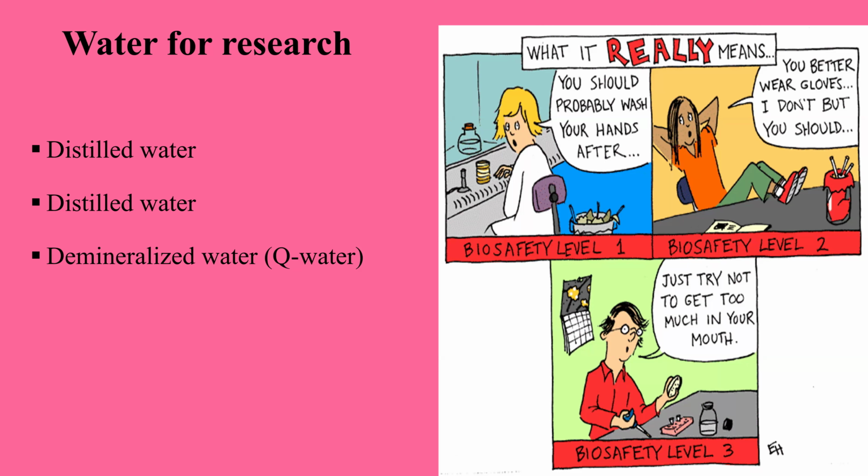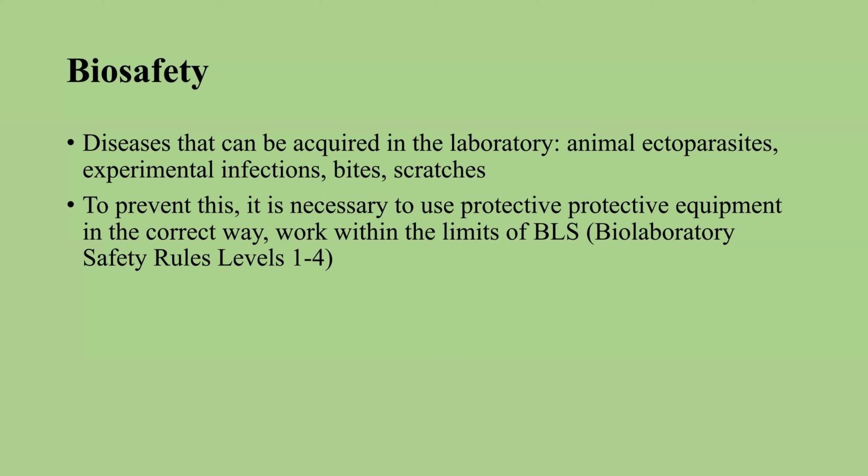It can be distilled water, twice distilled water, and deionized or demineralized water. It's good practice. Twice distilled water is very good for experiments. It's quite enough.